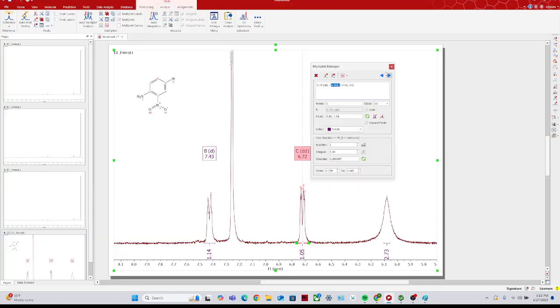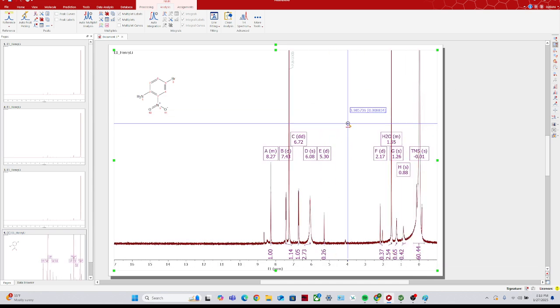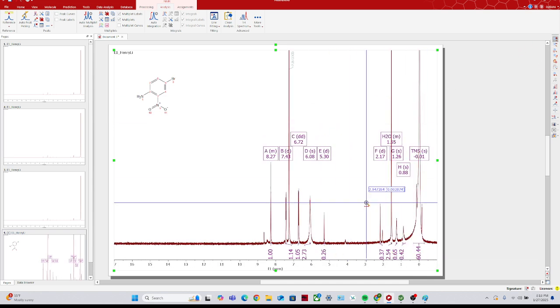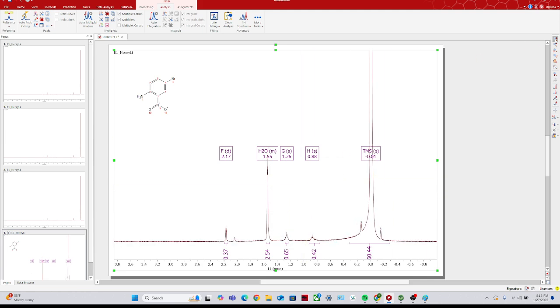Another thing I'd like to note about basic NMR literacy is that a lot of the stuff we're doing in this class, based off what Professor Wiseman has told me, is crashing out solvents. And so to do that, if you have really nonpolar stuff, you're going to use a lot of water. Water is at 1.55 to around 1.6. So whenever you see a singlet at 1.55 to 1.6, there's a great chance you probably have water inside of your product.